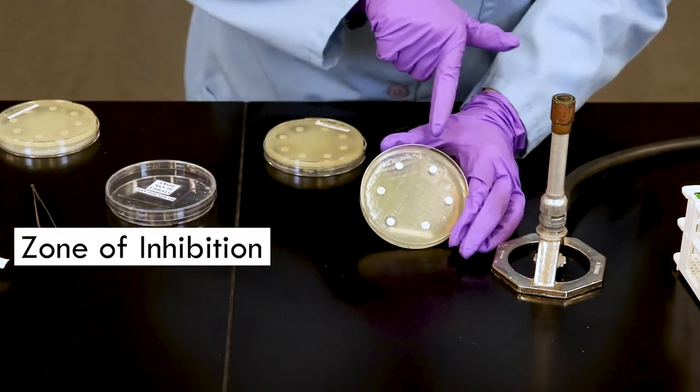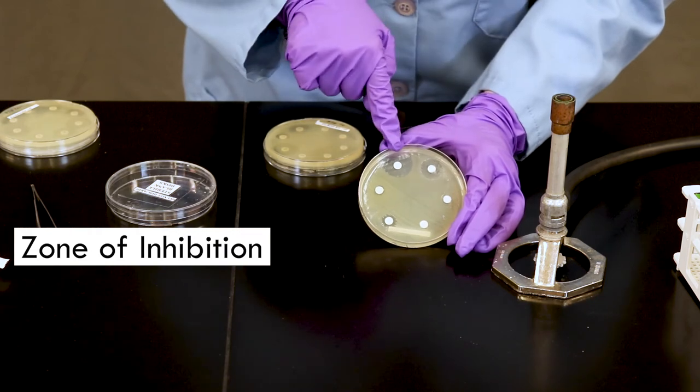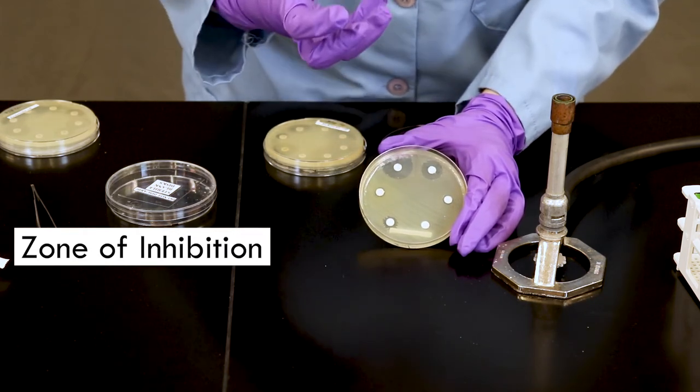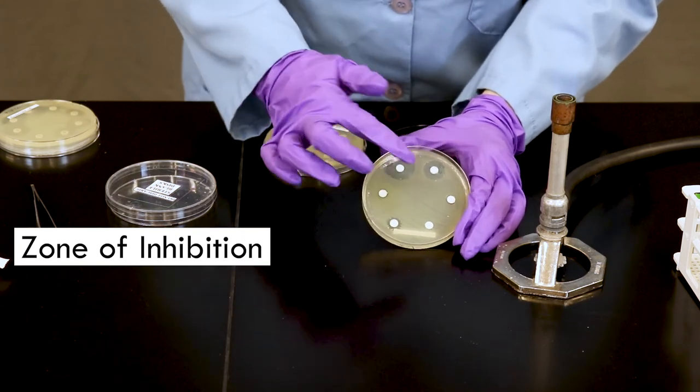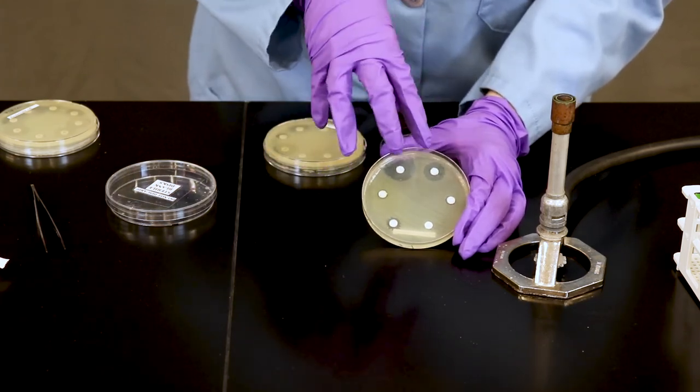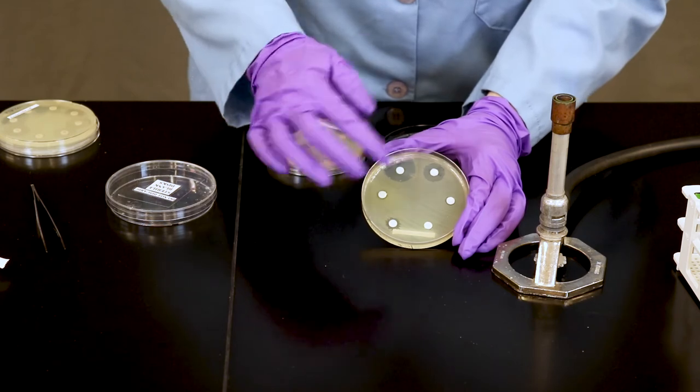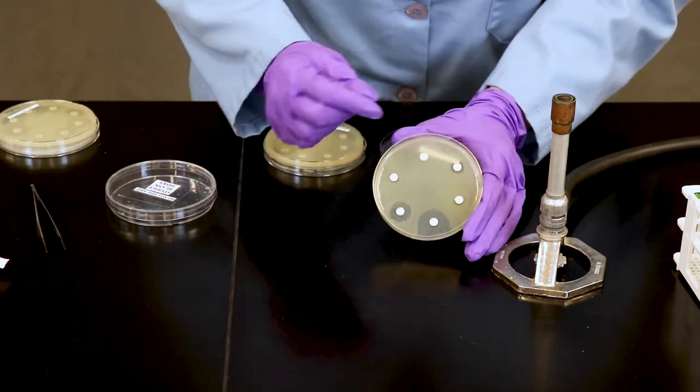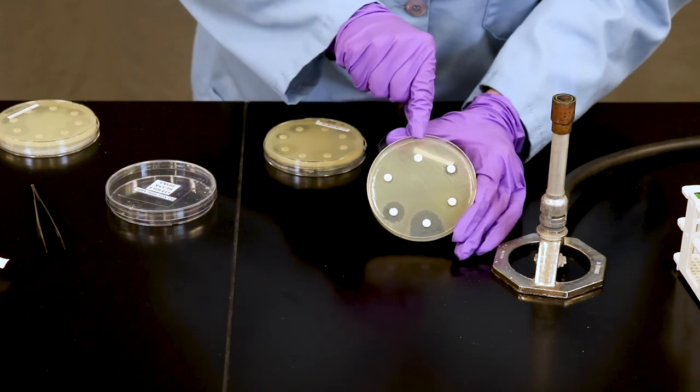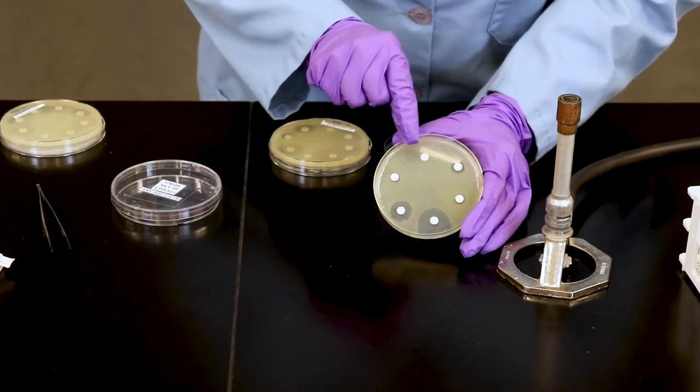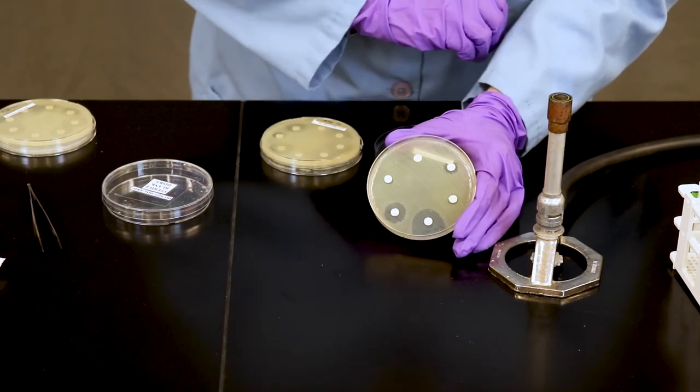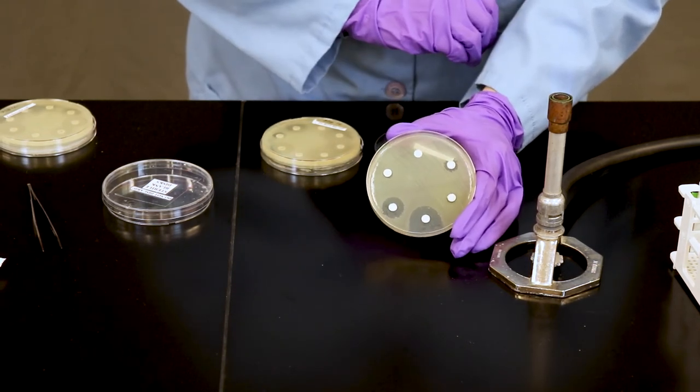So notice for these two particular chemical agents up here we see a clearing or a zone of dead cells present around where the chemical diffused into the agar. If the chemical agent was not effective, like this chemical agent up top that I'm pointing to here, you'll notice there's no zone of inhibition present. So we'll take a look at our data, and you guys are going to analyze this for your lab worksheet.